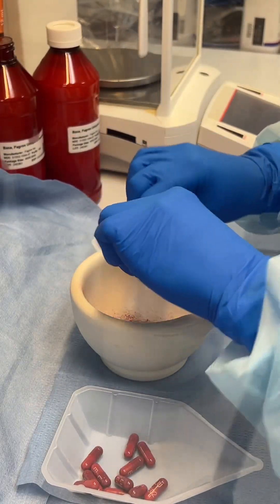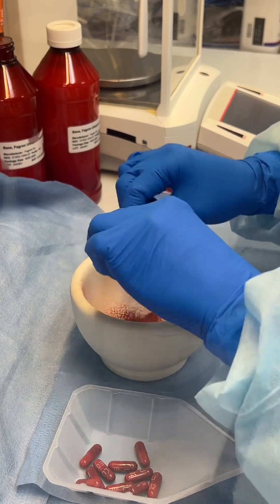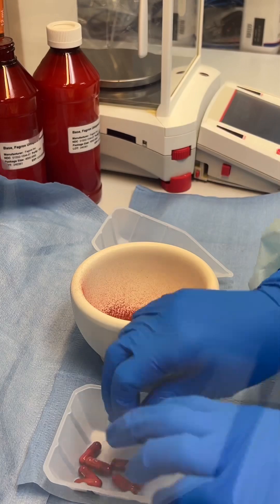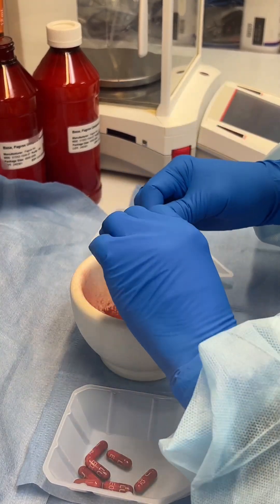Follow along as we create a rifampin suspension from capsules today. Creating a compounded rifampin suspension from capsules involves careful handling due to the drug's staining properties and its sensitivity to light and moisture.